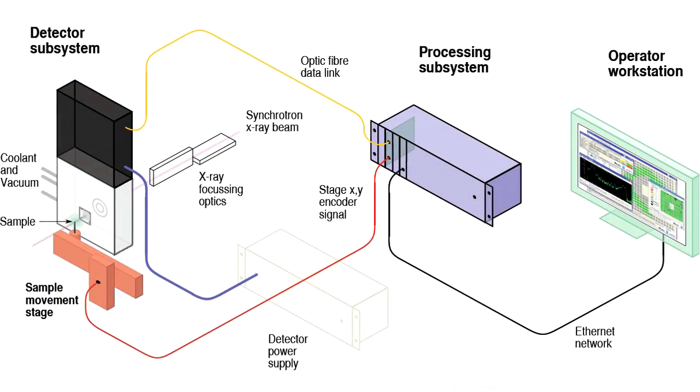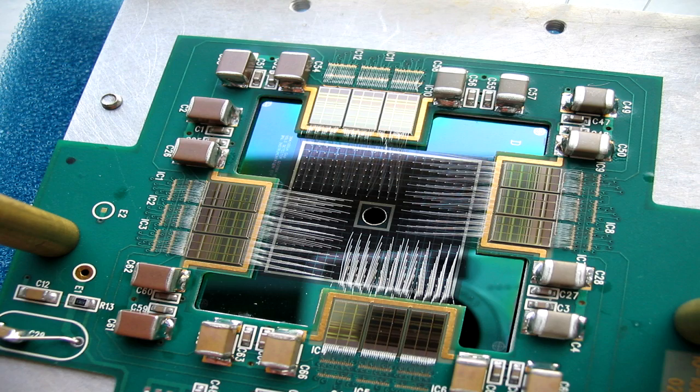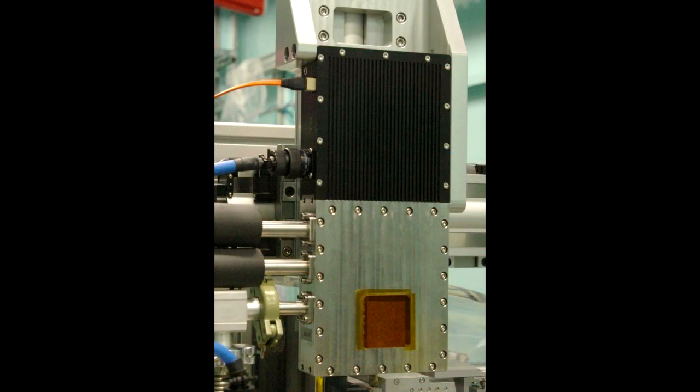So this is a collaboration between NSLS and the instrumentation division and an operation called CSIRO in Melbourne, Australia. The guys in Australia have expertise in high-speed data processing and image manipulations, and that jives exactly with our need to swallow the data from a high-speed detector that we developed here. So the collaboration between the two gives us the capability of putting together this integrated instrument that lets us do these really fast scans with high resolution.